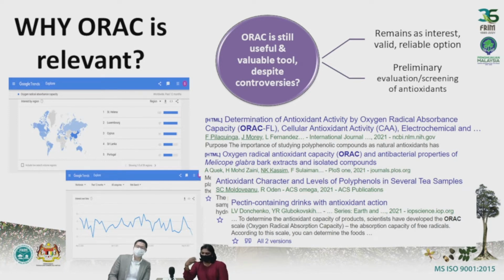Yeah, and besides that, there are also recent publications found in year 2021 related to the ORAC assay, a few of which I pulled out and put there, so you can have a look. And moreover, FRIM is still receiving samples from the industry for ORAC testing without fail, and I believe that ORAC is still a useful, valuable tool despite its controversy. This is because it still remains a valid and reliable option for the preliminary evaluation and also for screening of antioxidants.